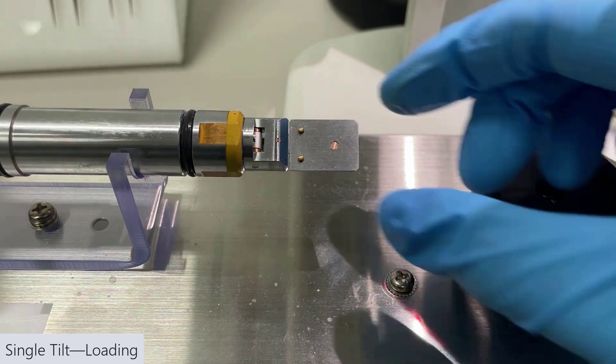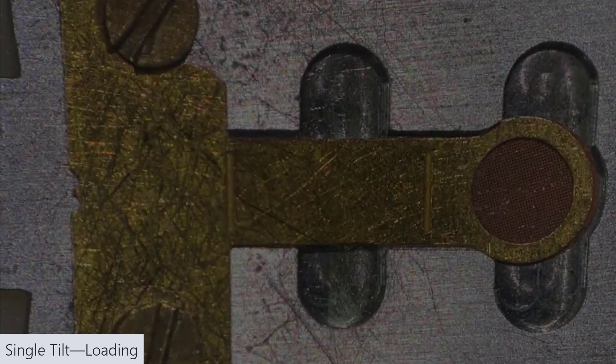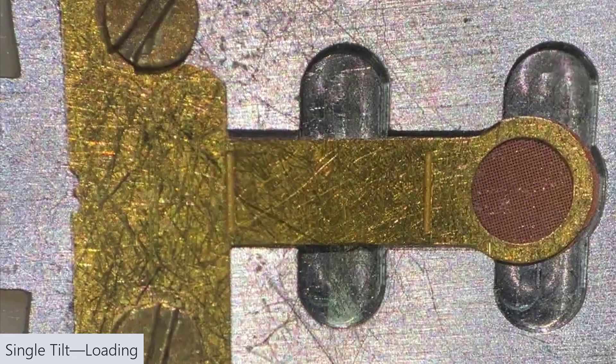It'll move side to side a little bit, and that's fine. You don't want the blade to be able to come out. This is what it looks like when the sample is seated properly.